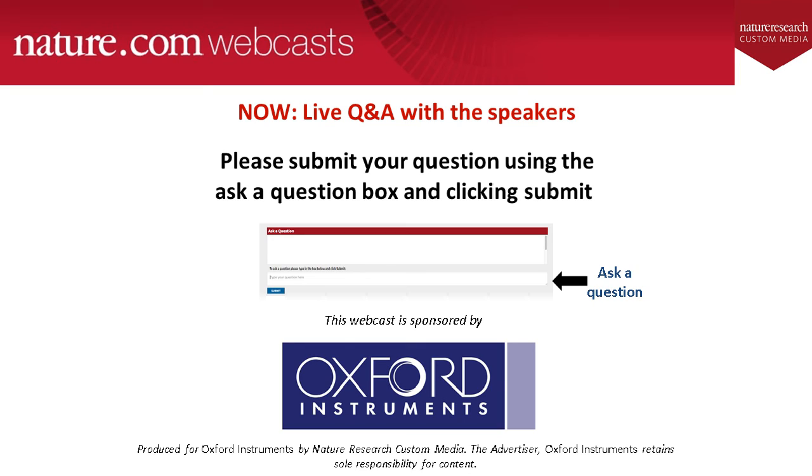Excellent. Thanks, Louise. And our next question is for you, Erin. And this one asks, what EM labels could be used in combination with EDS? Yeah, so you can use quite a few different labels. You can introduce nanoparticles into your sample via secondary antibodies, which are conjugated to colloidal gold or nanoprobes of different elements.